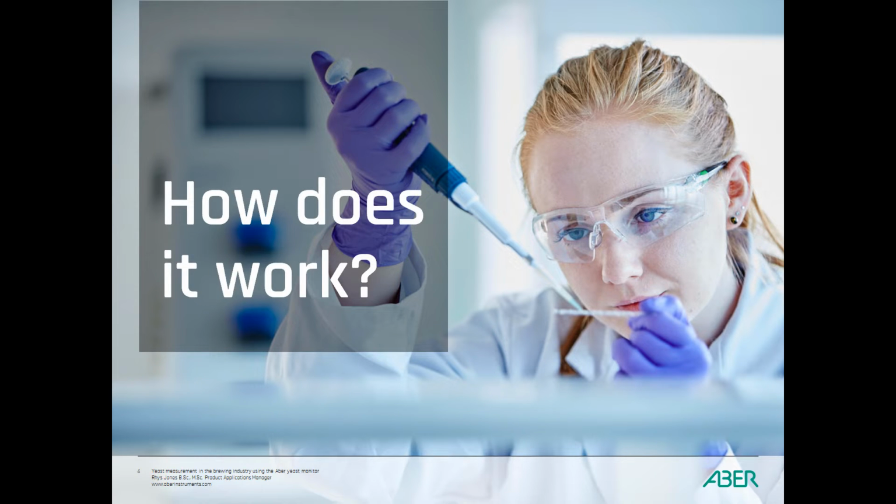So, how does the technology work? In other words, what are the principles behind the Aber measurement? Aber technology measures two basic parameters. We measure capacitance and conductivity. Put simply, capacitance is the ability of a substance to hold charge around itself, while conversely, conductivity is the ability of a substance to give charge or to allow charge to flow through it.